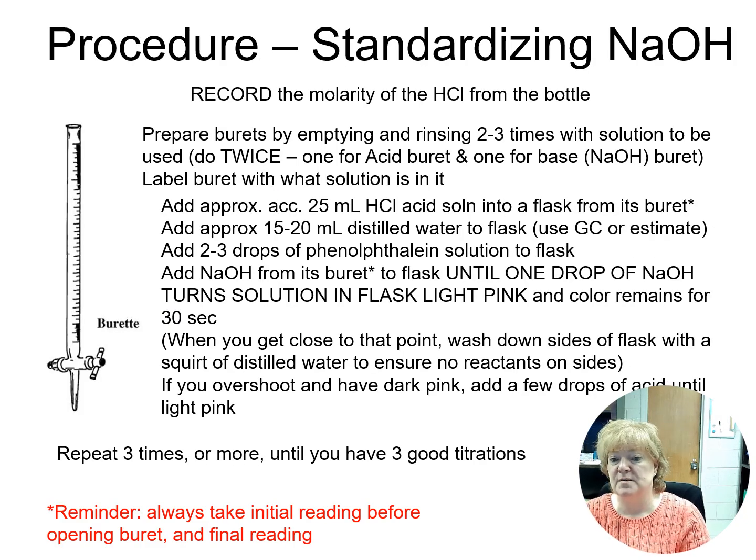All right, so more specifically, part A, the standardizing of NaOH. You're going to have to come in, record the molarity of the HCl from its bottle. Again, it should be about 0.1, but record whatever the bottle says. We need that information, so make sure you write it down.